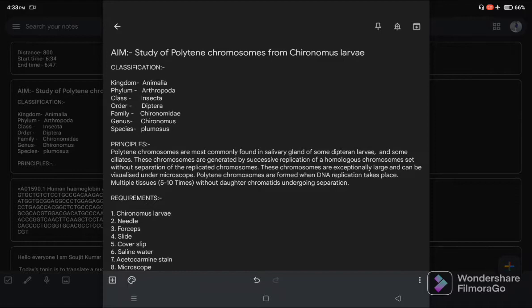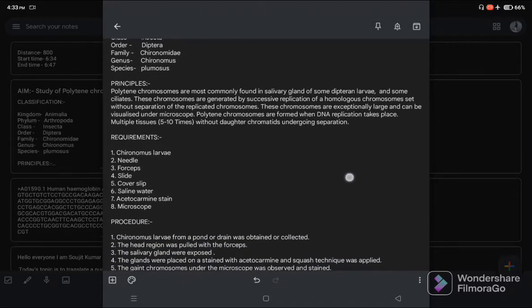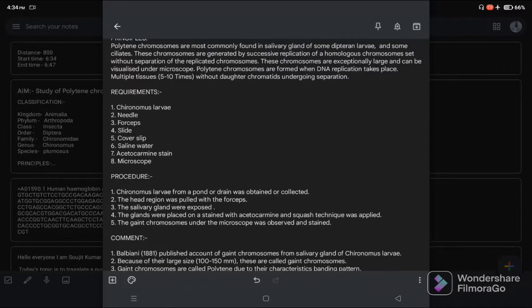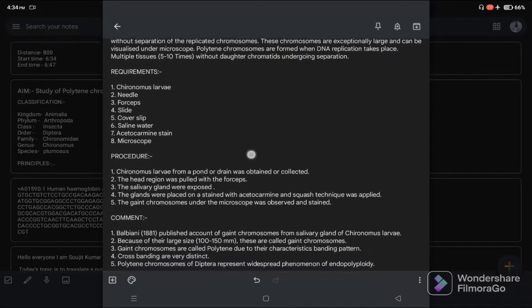For this experiment, the requirements are: Chironomus larvae, needle, forcep, slide, coverslip, saline water, acetocarmine stain, stand, and microscope.